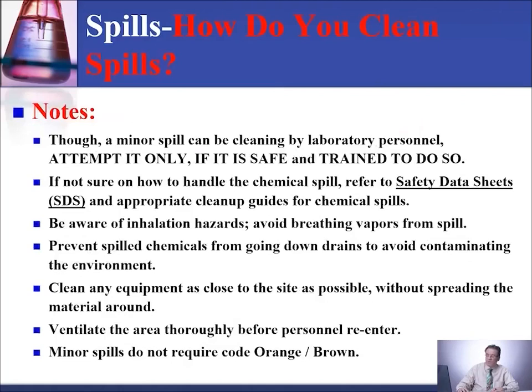Notes regarding how to deal with the spill. Though a minor spill can be cleaned by laboratory personnel, it should be attempted only if it is safe to do so and you are trained to do so. If not sure how to handle the chemical spill, refer to safety data sheets and the appropriate cleanup guideline for chemical spills. Be aware of inhalation hazard.